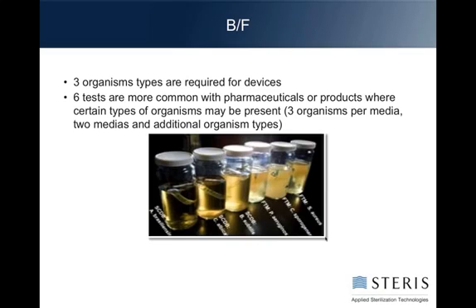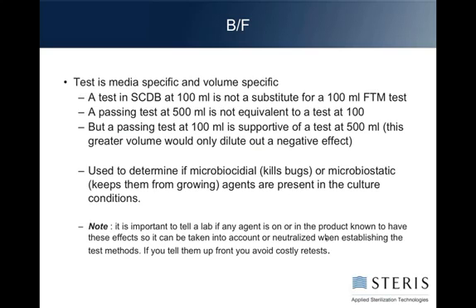And what you have here in the picture is the ones that look kind of cloudy off to the right are the ones that are growing. And on the left, the ones that are clear are the ones that are not growing. And this is the one test where you really want the bugs to grow. You want to know that under these test conditions a living bug will grow, because you want to be able to see it if it's present in your product.